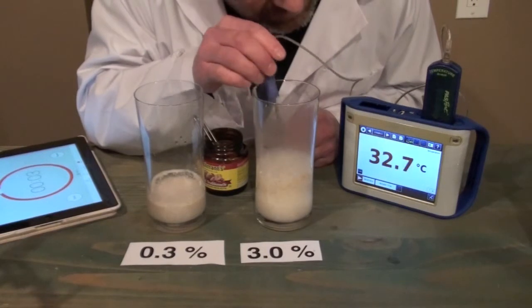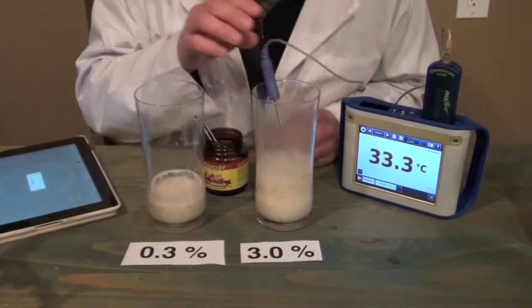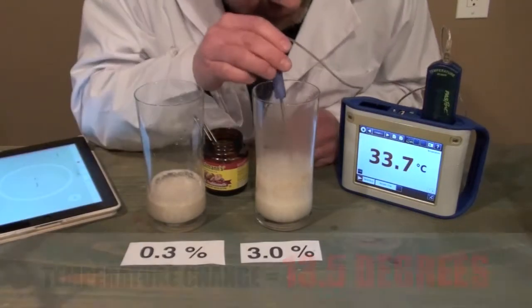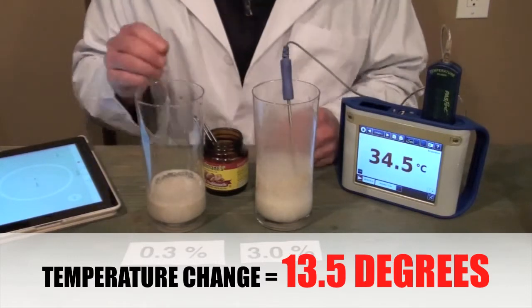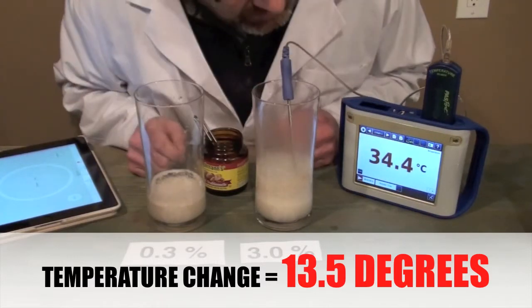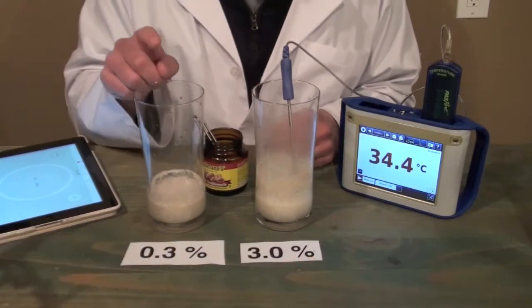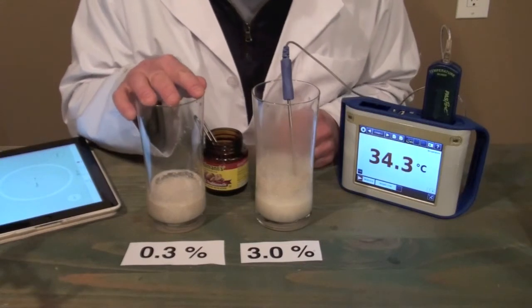And timer's almost done. And after 1 minute, it looks like the temperature has gone up about 14 or 15 degrees, much more than the 0.3% solution of hydrogen peroxide.